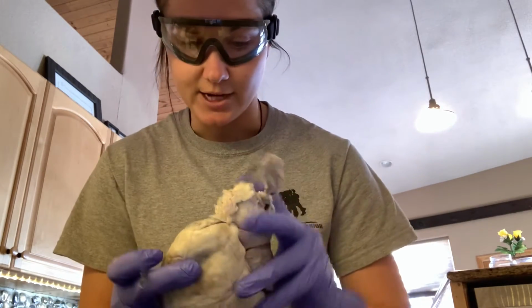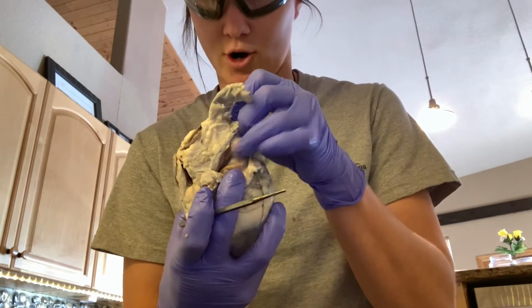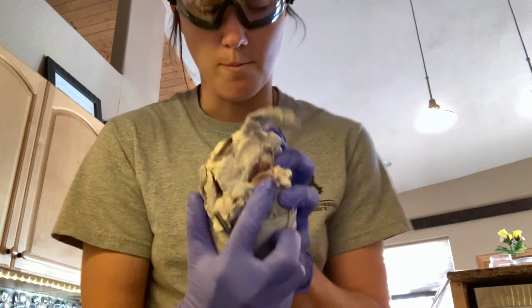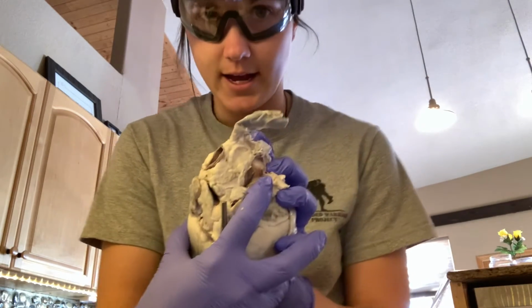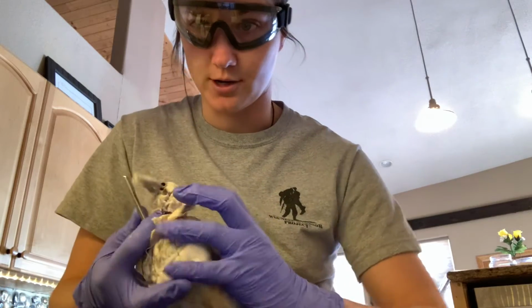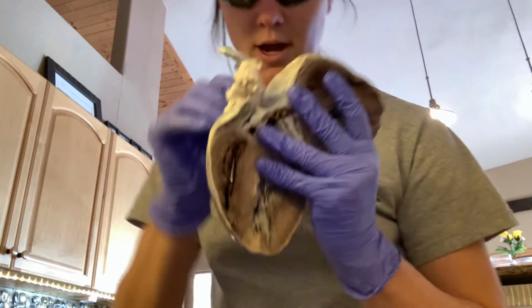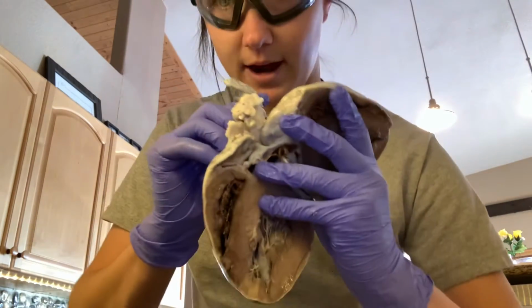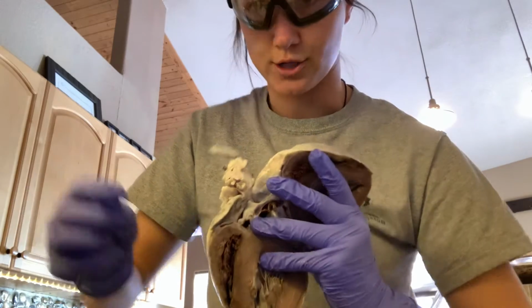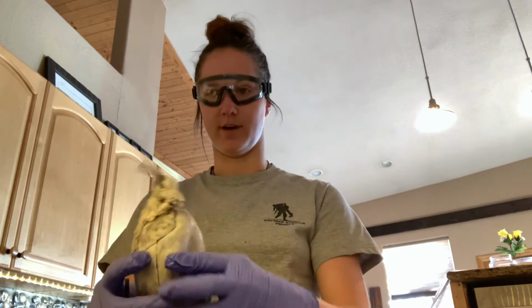So for the right atrium, we will start back here on the posterior aspect of the heart. This right here is called the superior vena cava, and this is where most of the blood pools before entering the right atrium. I'm going to take my blunt probe and we're going to go through here just like so. As I open up the heart, my blunt probe ends up in the right ventricle. And the right atrium and right ventricle are separated by the tricuspid valve.